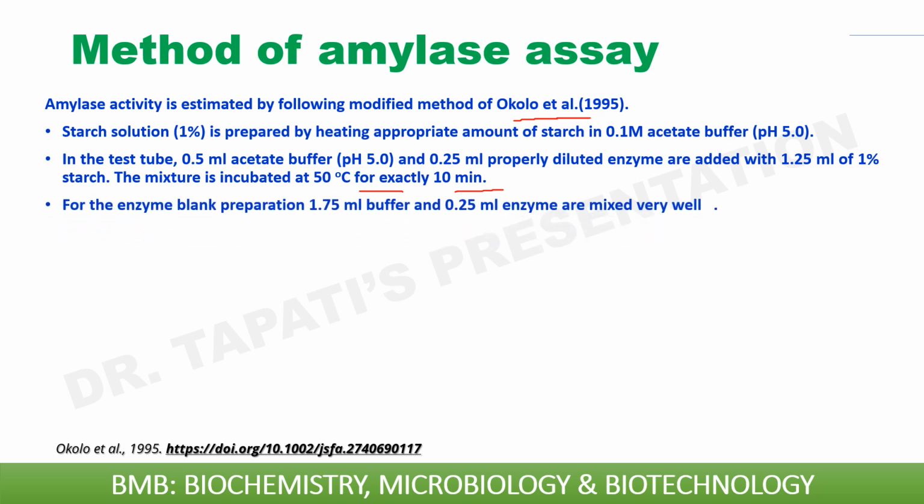For the enzyme blank preparation, 1.75 ml buffer and 0.25 ml enzyme are mixed very well. In this tube, we are not adding starch solution, only buffer and enzyme.